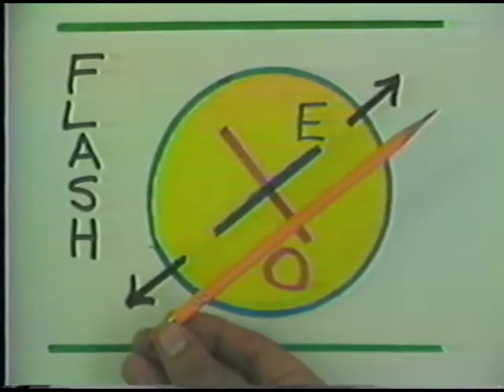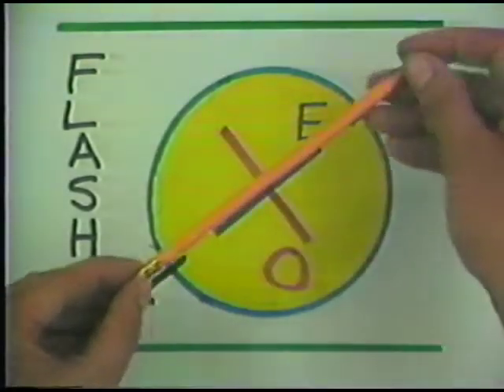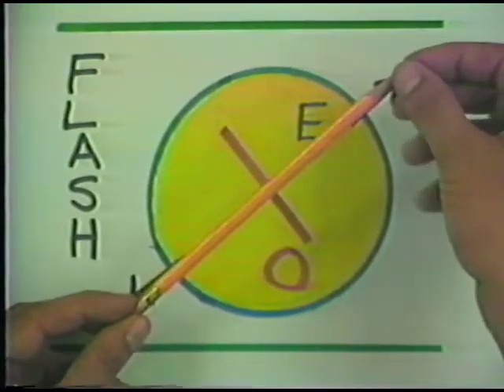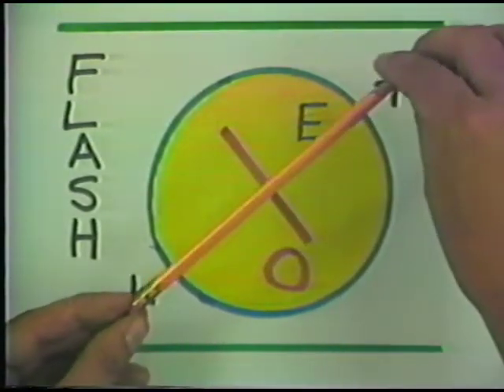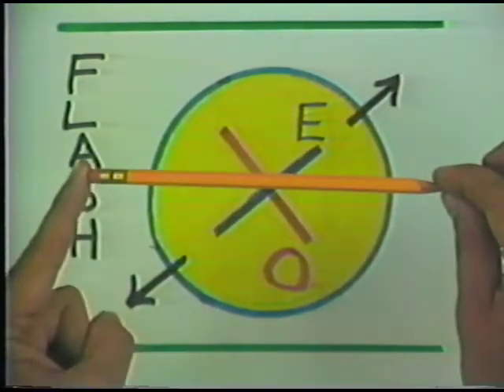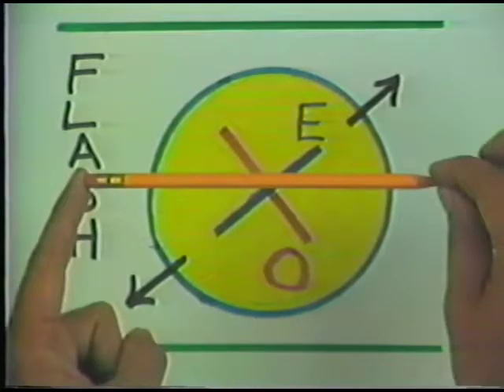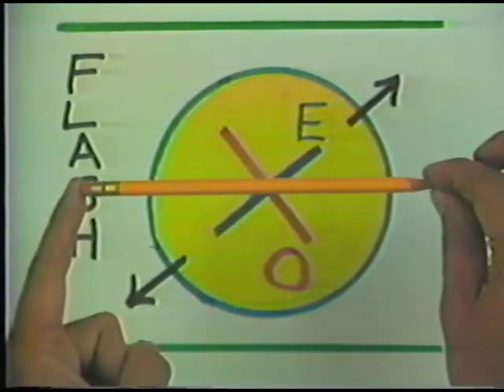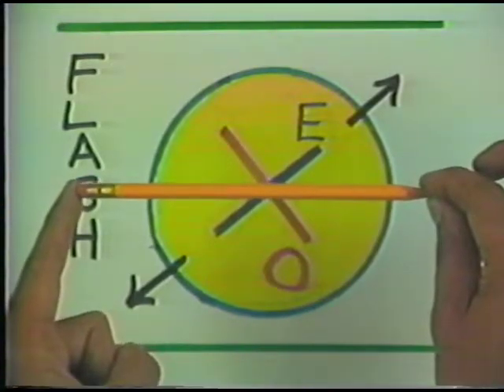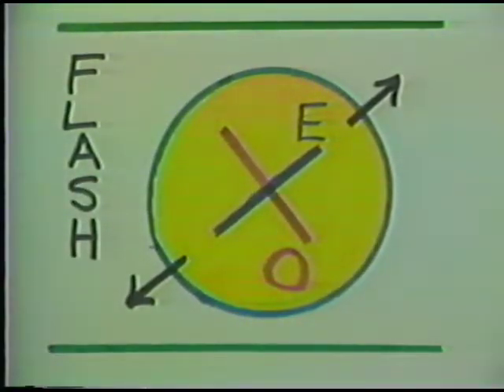So once you find this orientation on the particular mineral grain, then you want to take out your Bertrand lens and your converging lens, look at the mineral grain, uncross the polars and rotate it from the 45-degree position to parallel with your microscope polarizer. Then you can make the central illumination test or the oblique illumination test to determine the epsilon refractive index.